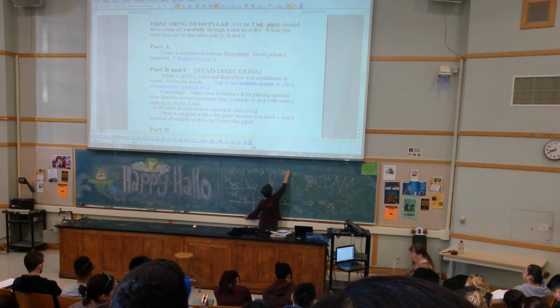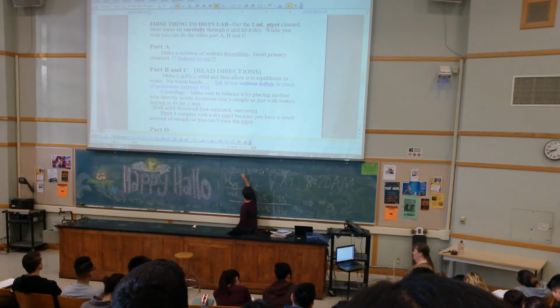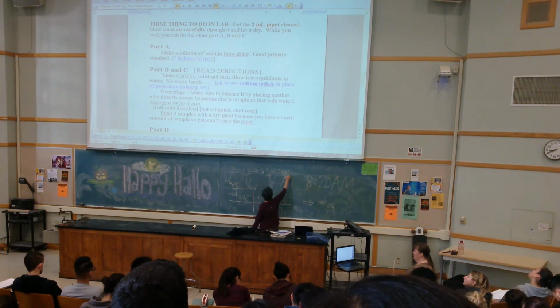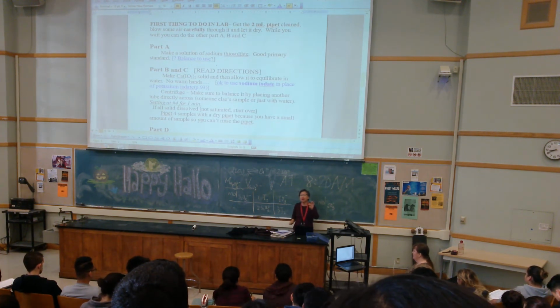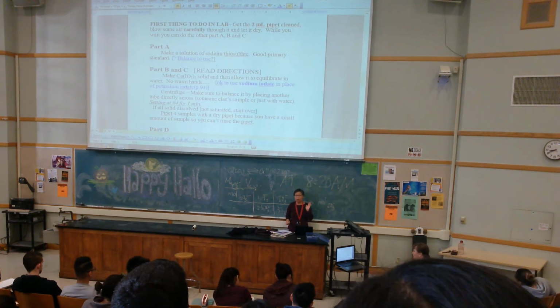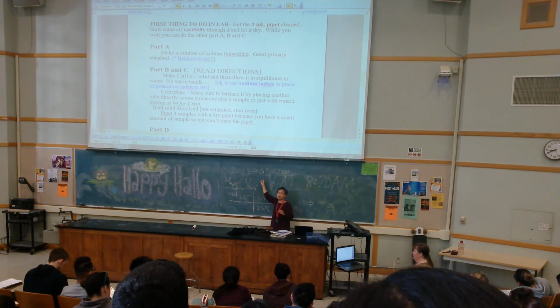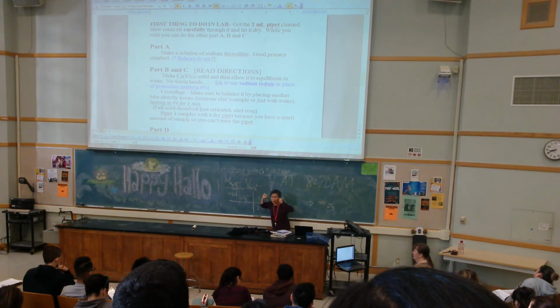So the source of your iodate and calcium should be purely from the dissolving of this. If at the end, the last amount of liquid you put in to get your sample has no calcium iodate, I'm sorry, you have to start from the beginning. The sample you're going to pull out has to have some solid in it before you pull it out.